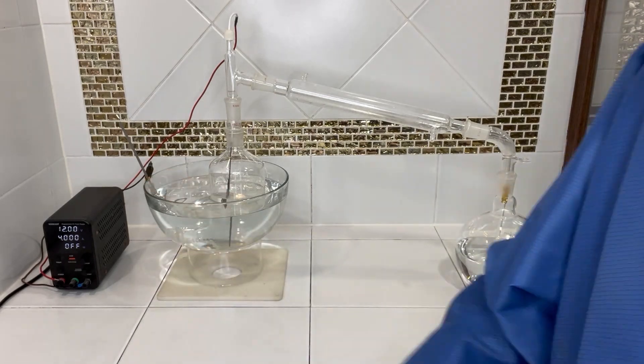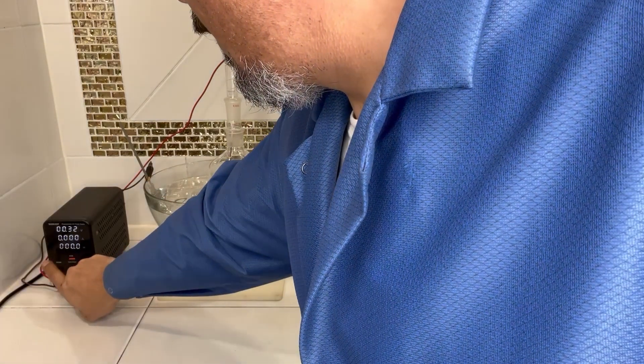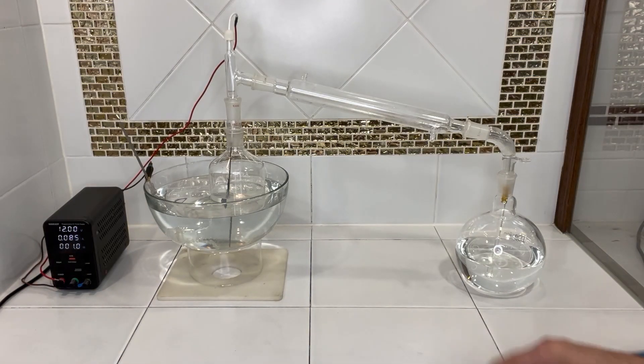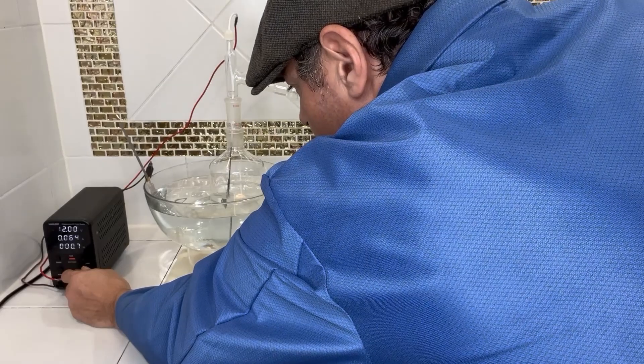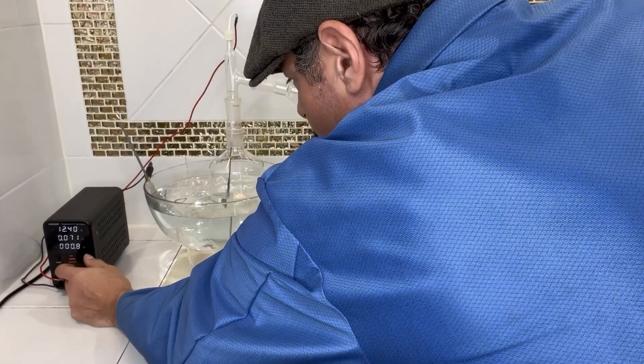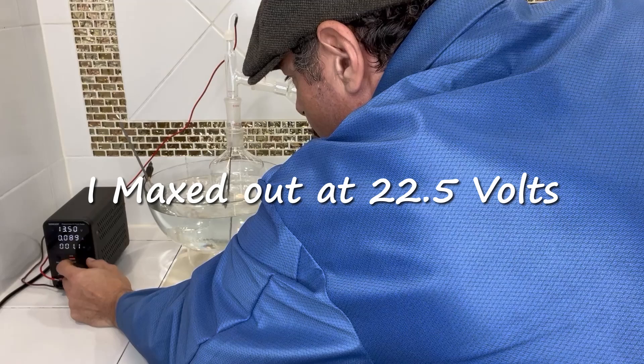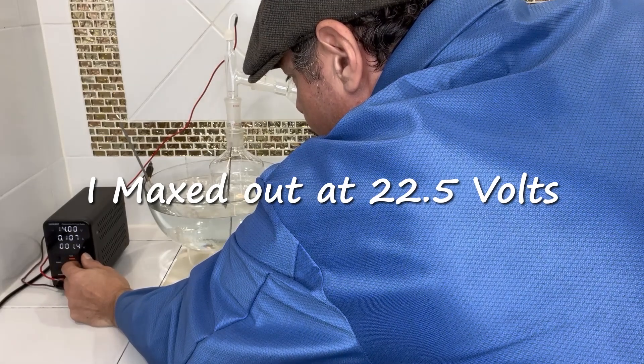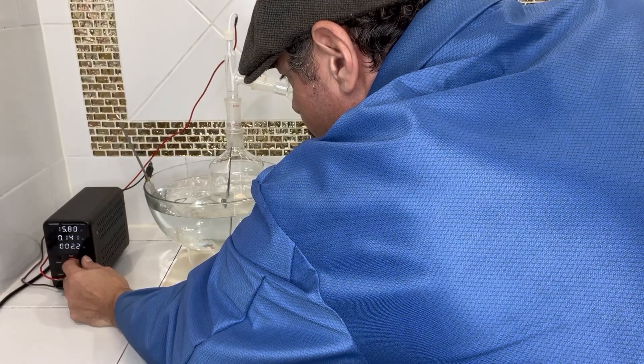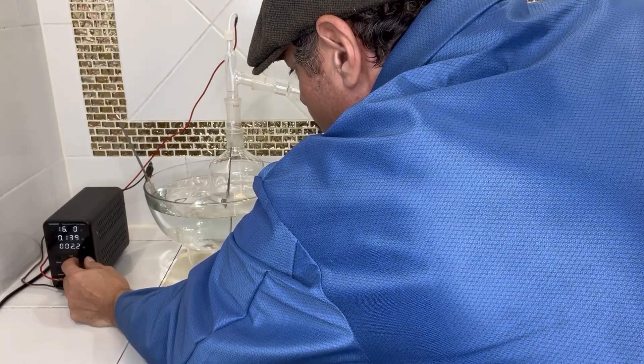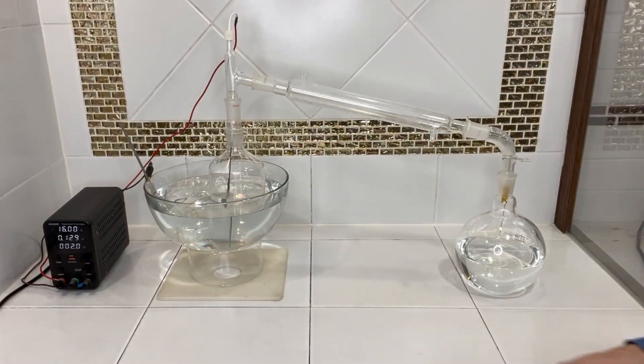So let's go ahead and get it turned on. I'm just going to start with 12 volts. Now I'm going to slowly adjust up the current until I start to see hydrogen forming on the cathode in little air bubbles. I'll bring you in for a little closer look.